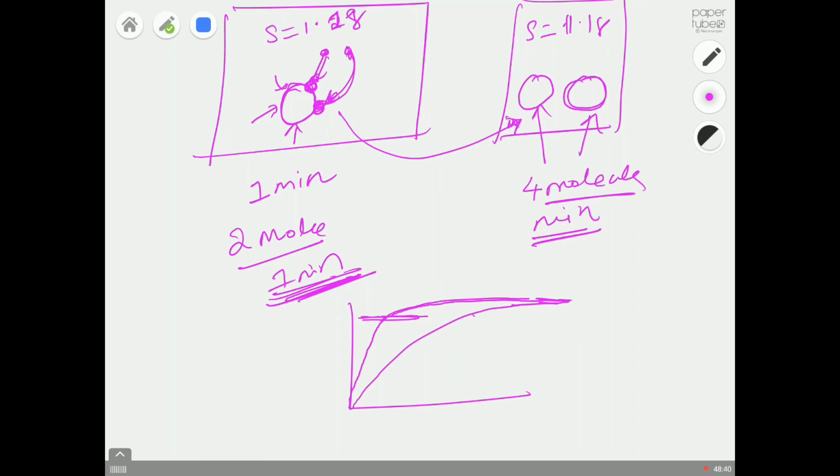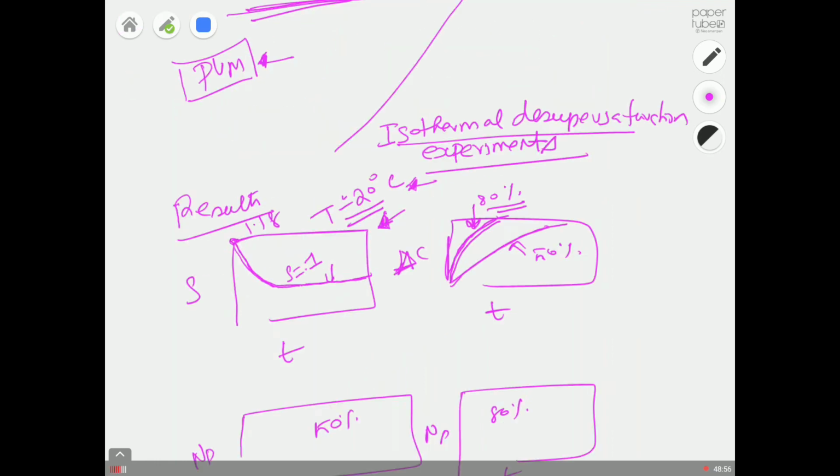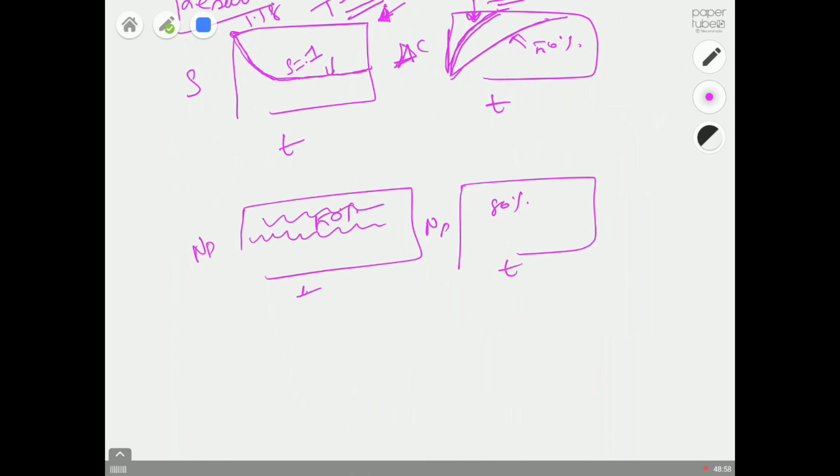For the discussion part, I know you don't have expertise in the crystallization field, so try to put at least two statements based on each figure, and then give some justification. Also explain why the particle counts are not changing, why they look almost constant.